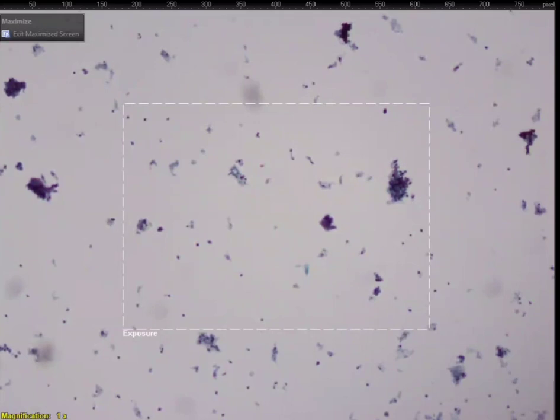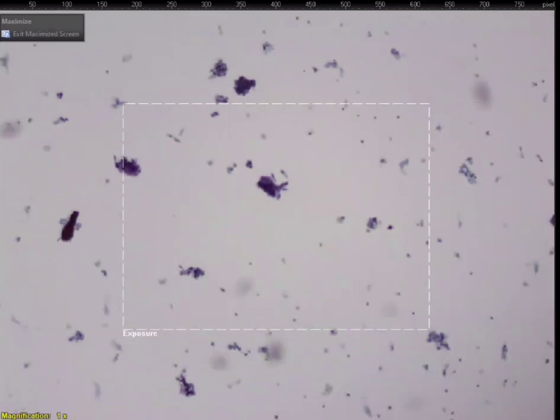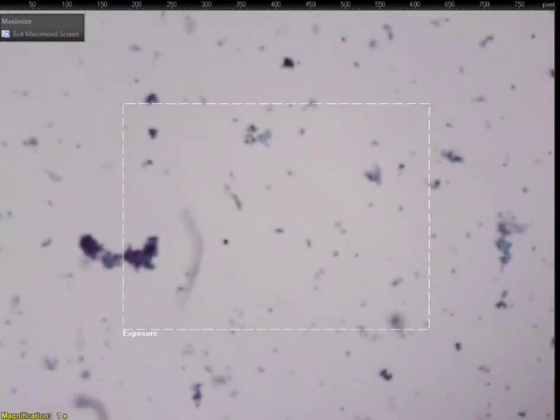Oh, yeah. So this is what they've done. They picked up a lot of lung tissue here. Everybody okay with this sample? Everybody comfortable with these respiratory cells? You can tell that they are all normal.